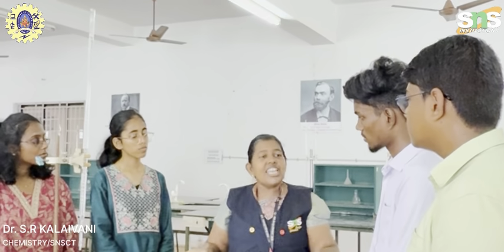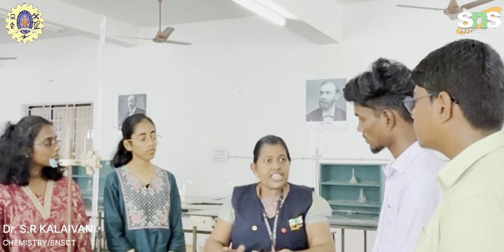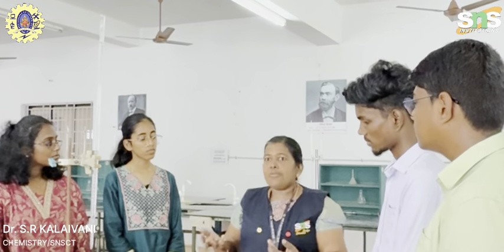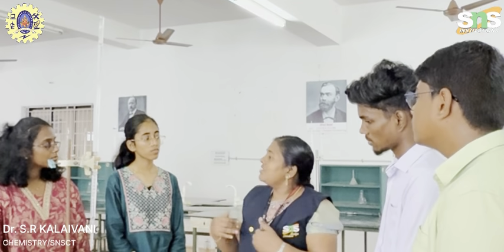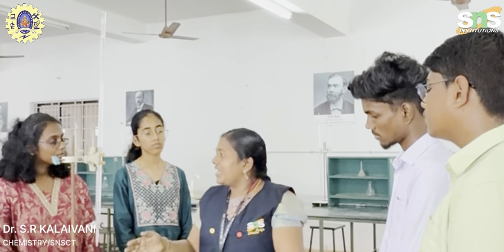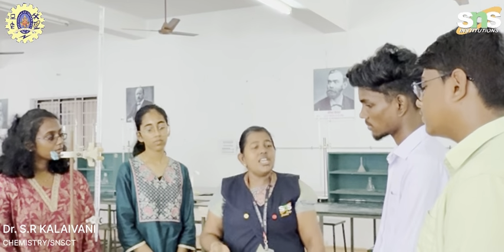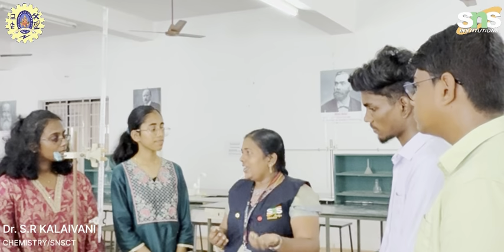But in our home, we can easily identify it: just take a water sample and lather it with soap. If it easily produces lather, the water is soft. In our laboratory, we can easily find out with the help of EDTA whether it is soft water or hard water. So the third titration aim is the boiled water.